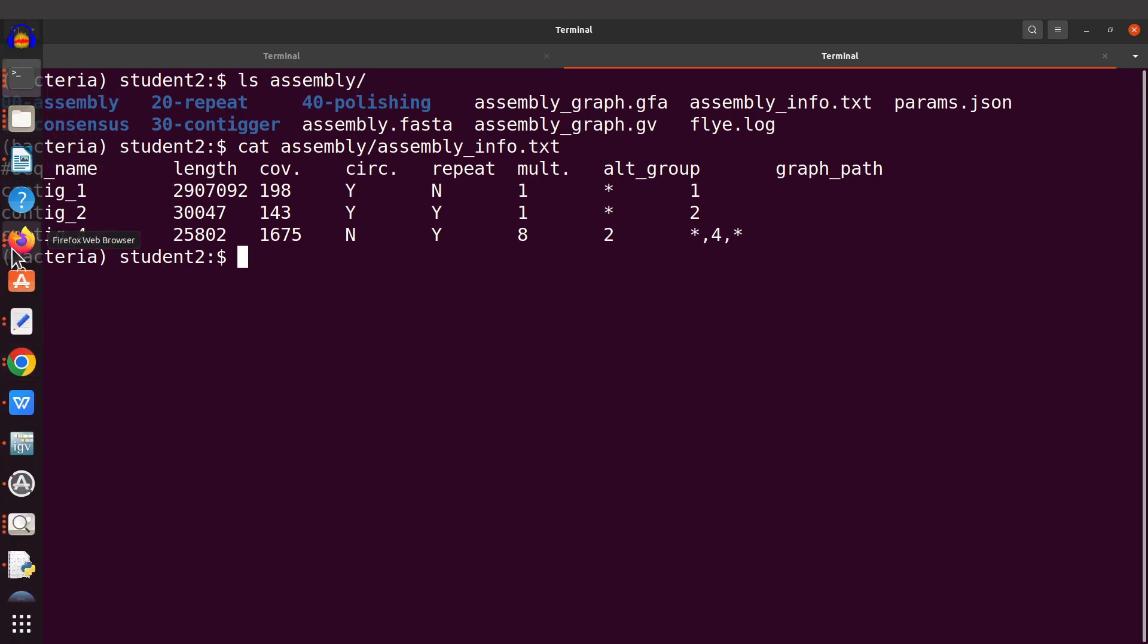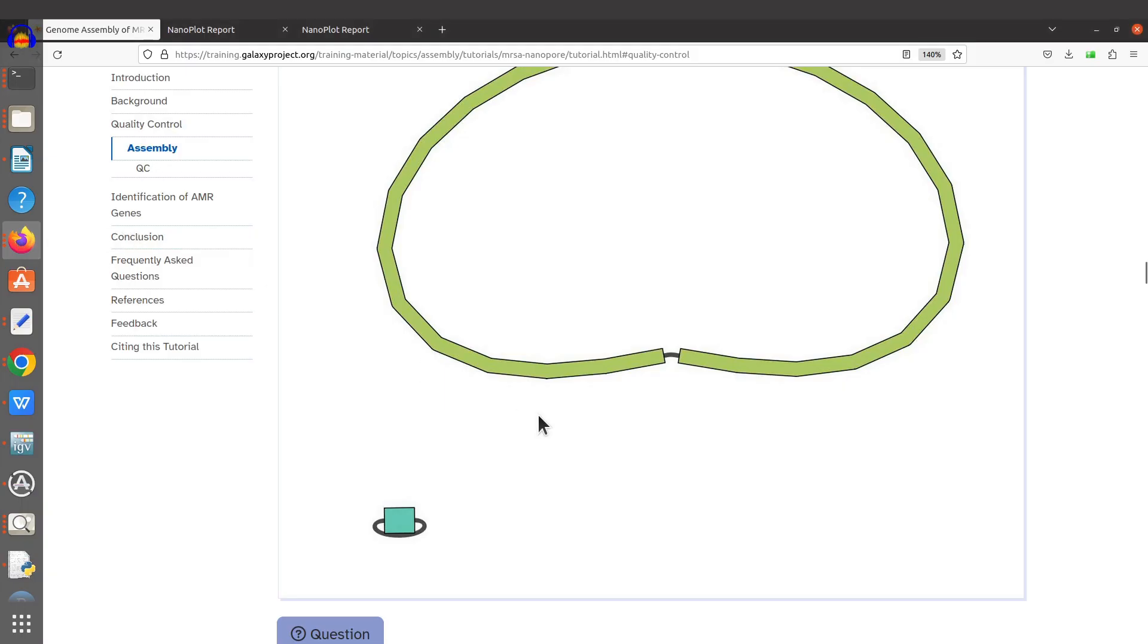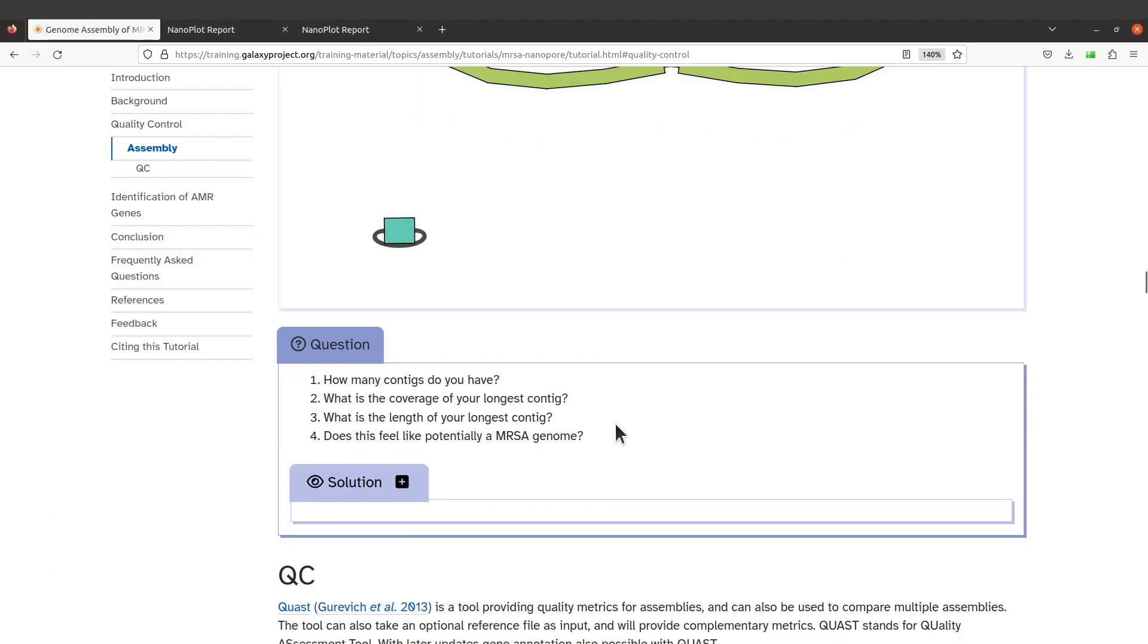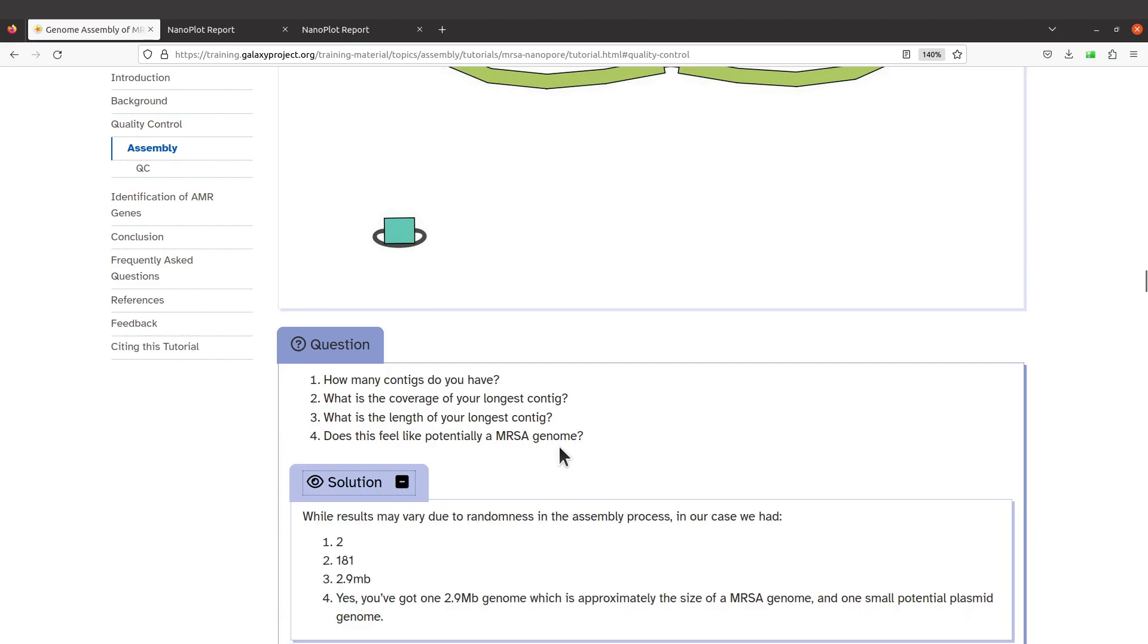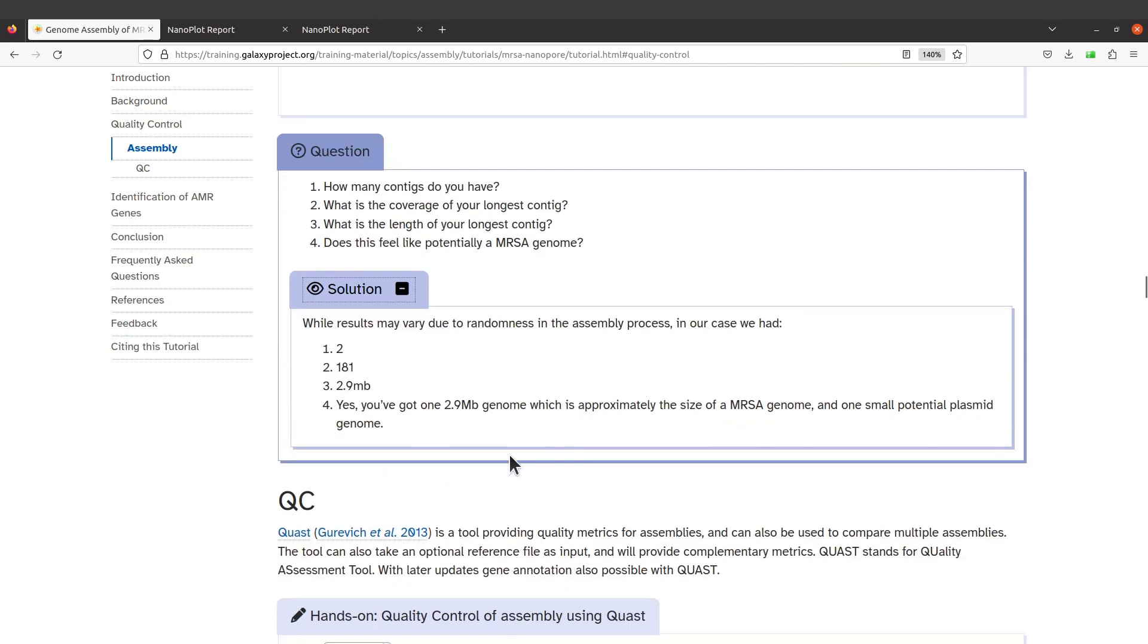Now let's go back to the Galaxy tutorial page. We have some questions here: How many contigs do you have? What is the coverage of the longest contig? What is the length of your longest contig? Does this feel like potentially an MRSA genome?